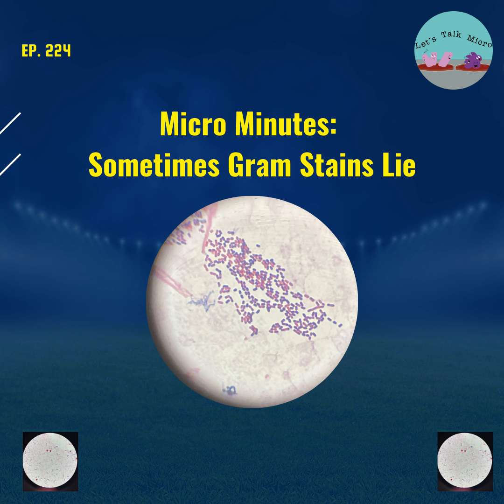But as I said, this comes from a place of repetition. And eventually, if you do this long enough, you'll see some of those. But keep that in mind. If you see that abnormal thing, before you call it, let's say, fungal elements or something, make sure that you check the patient's history, maybe repeat a stain or ask someone.